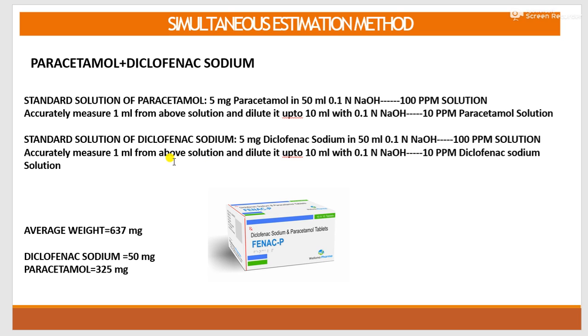While preparing the solutions, sonication is required, and after preparation of the 100 ppm solutions, both are filtered through Whatman filter paper, and then further dilution is done.